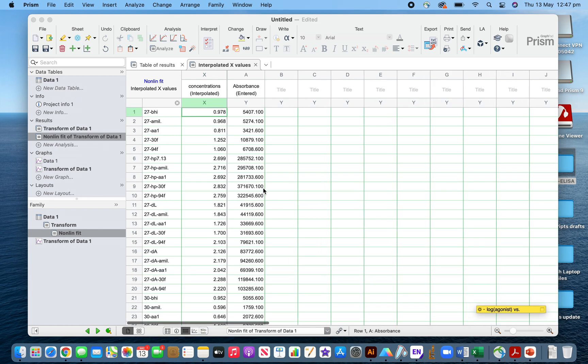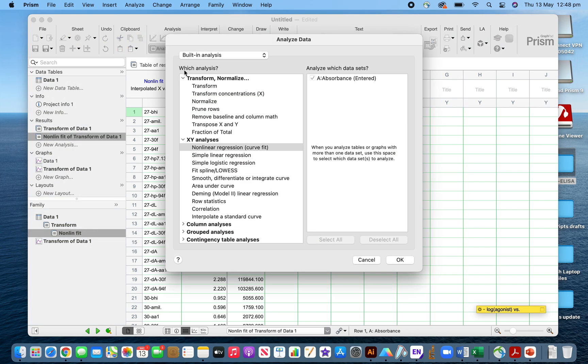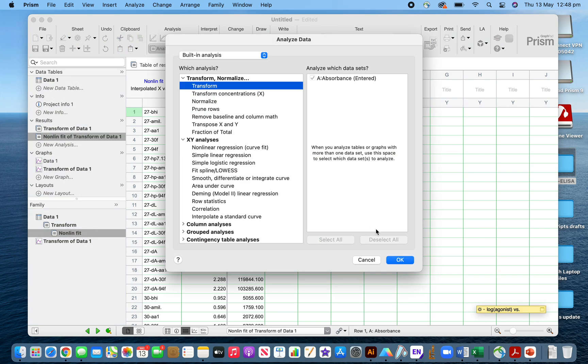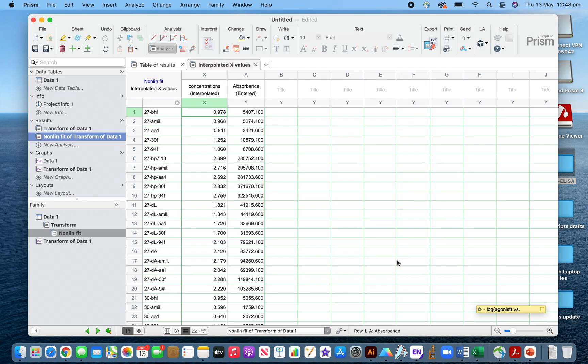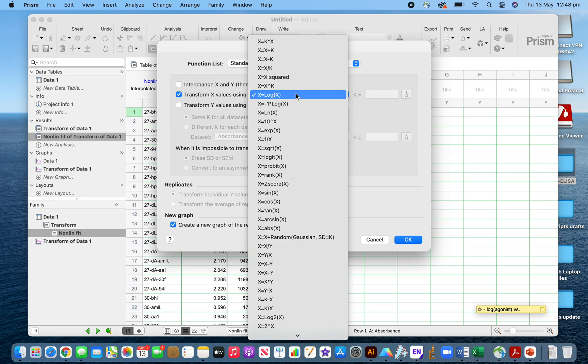Now what you have to do is transform these concentrations to the anti-log, because previously you did the transformation. To do this, you have to do again the analysis, then transform using the similar method.